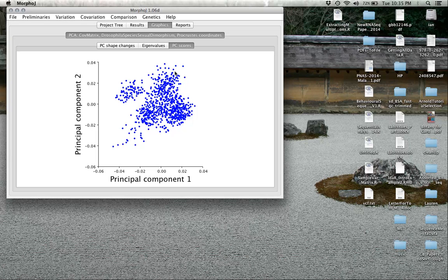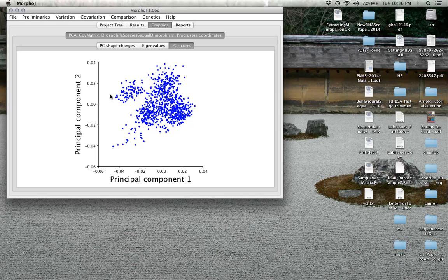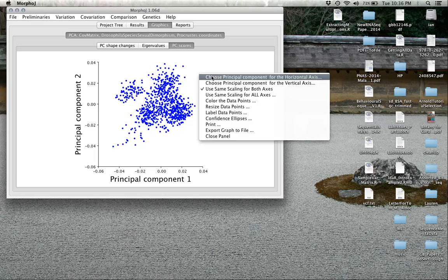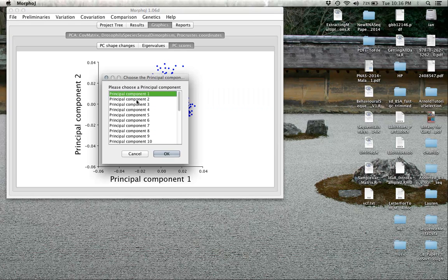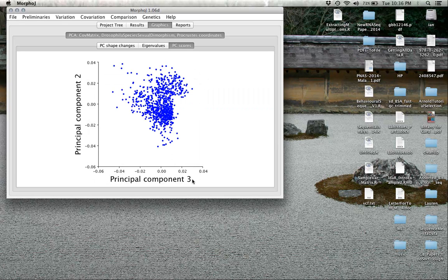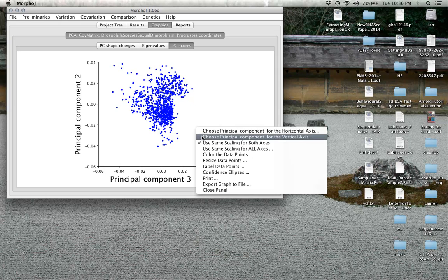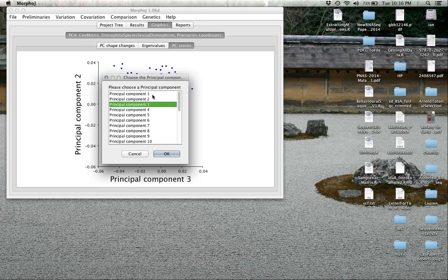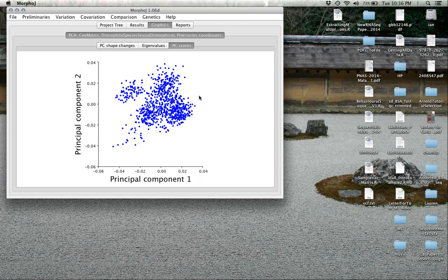The final figure we can look at is the PC scores. This is showing the first principal component against the second principal component, where each observation lies. If you right-click here, you can choose what principal components you want to look at. We could easily change this to PCs two and three, but let's change that back to one and two.